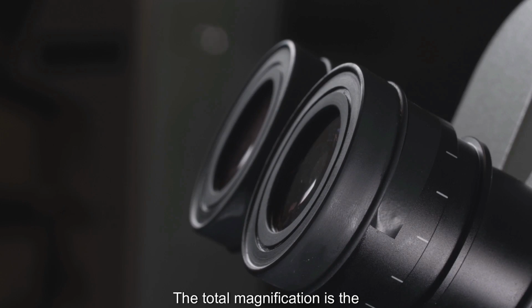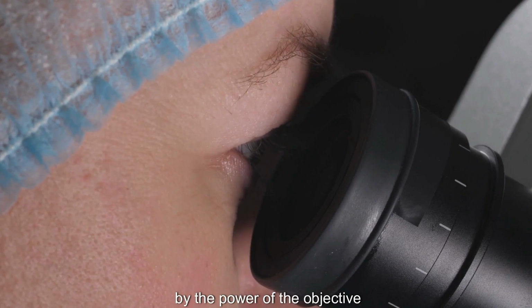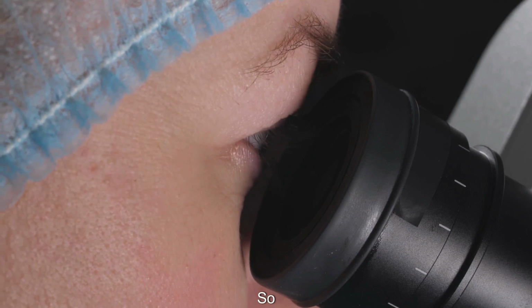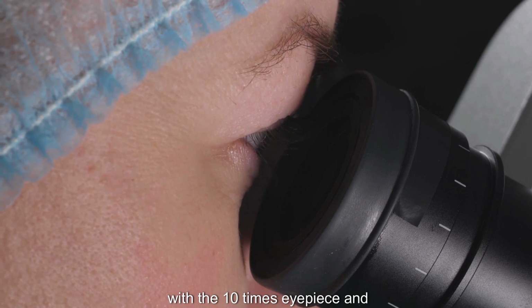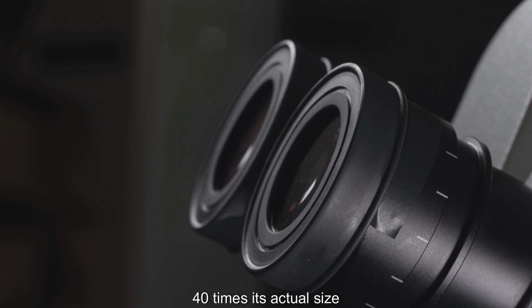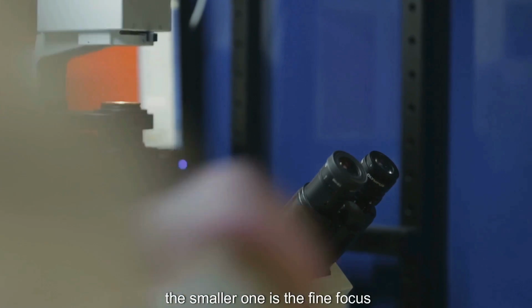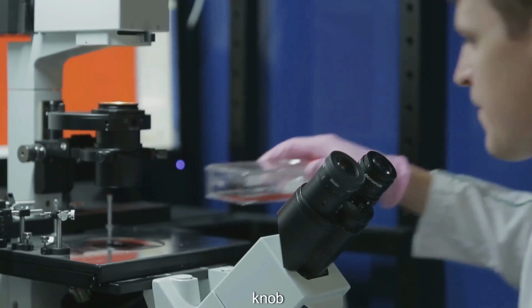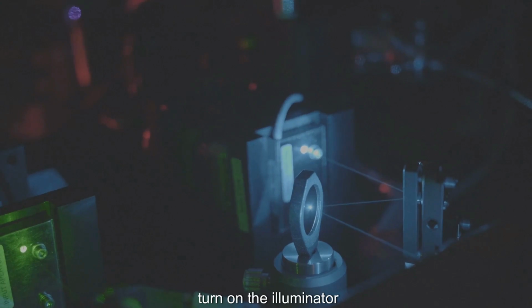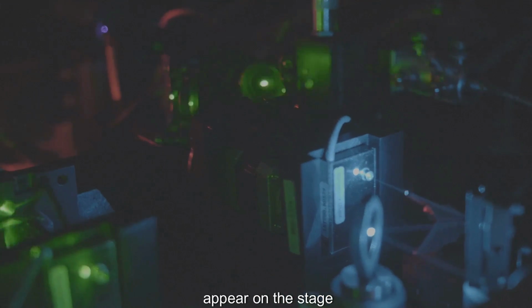The total magnification is the power of the eyepiece lens multiplied by the power of the objective lens you are using. So, with the 10 times eyepiece and the 4 times objective, you are seeing the object at 40 times its actual size. The larger one is the coarse focus knob, the smaller one is the fine focus knob. Finally, turn on the illuminator. You should see a circle of light appear on the stage.